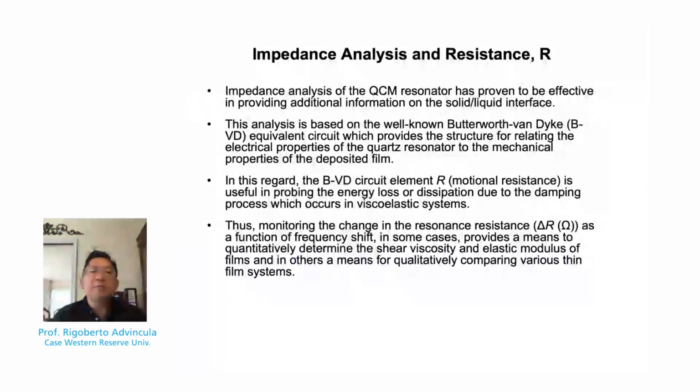This is equivalent to an impedance analysis of the QCM resonator, which again can be done using a network analyzer to have a better description of this viscoelastic nature in various media. However, a very well-known plot based on the Butterworth-Van Dyke equivalent circuit shows that plotting the resistance element versus frequency allows one to prepare a viscoelastic interpretation of the deposited film.